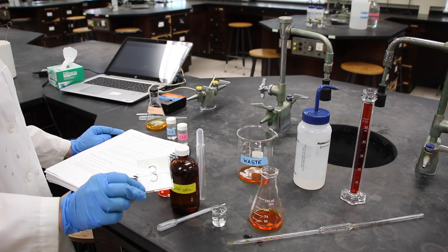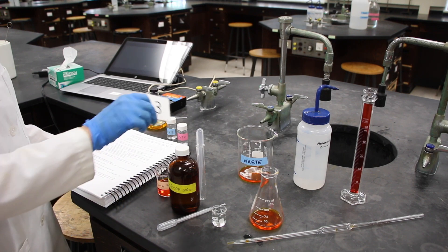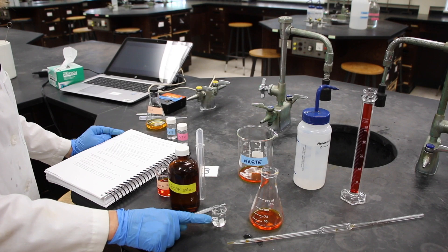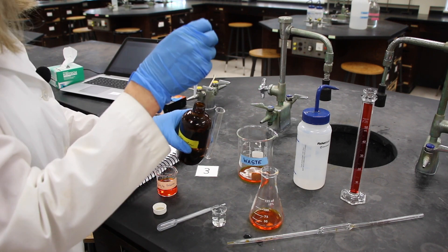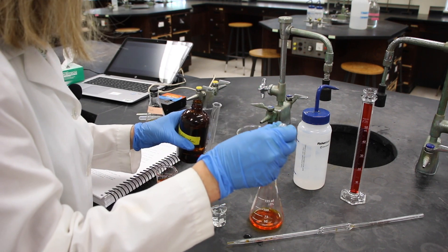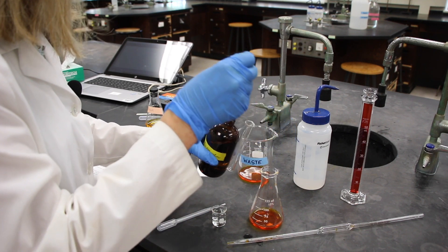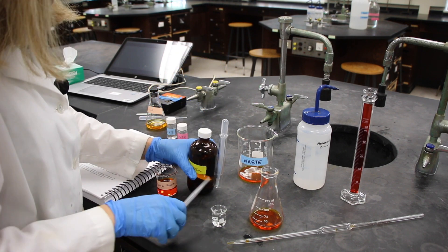In step 3, I see that we've been assigned solution 3 to make. Solution 3 has 15 drops of 10% ethanol and 5 drops of DI water. So first I will add the 15 drops of the 10% ethanol, and then I will add 5 drops of DI water.